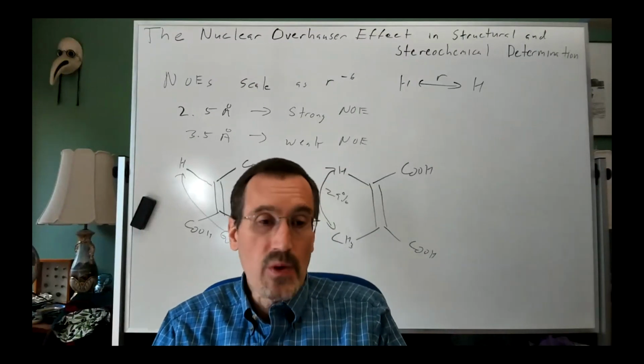James, may I briefly share my screen? I opened up the COSY of strychnine just to demonstrate how the contours work. Absolutely. And anyone who needs to run off, please feel free.